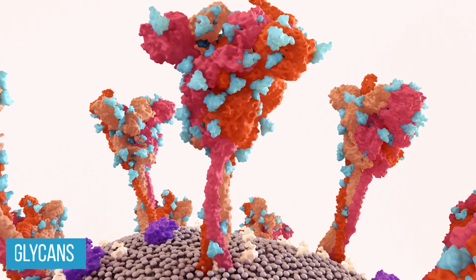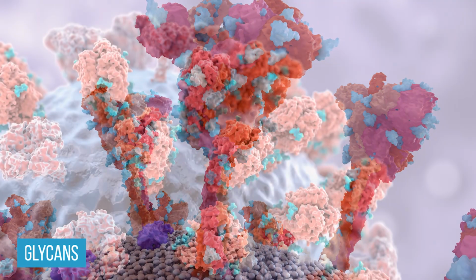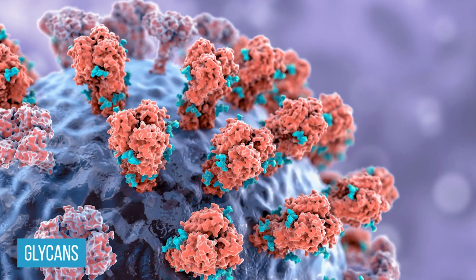We can measure masses, but we cannot measure structures that easily. In the past you used techniques like NMR and maybe even crystallography, but those techniques also have difficulties studying glycans. And so one of the weaknesses of mass spectrometry is that if we have two glycans that have exactly the same mass, but a distinct structure, maybe because they have a distinct linkage of the chemical bonds, then it's harder for us to distinguish them. The field is working on new techniques like ion mobility or spectroscopy to also distinguish what we then call isomers, because they have exactly the same mass. But it's still at the moment one of the challenges to cover by mass spectrometry in glycoproteomics.